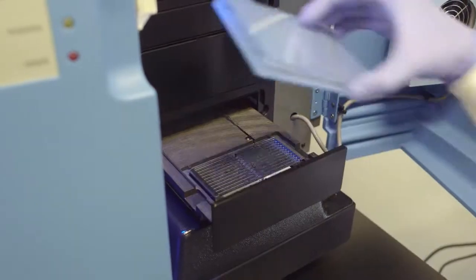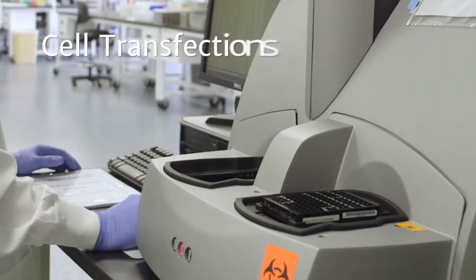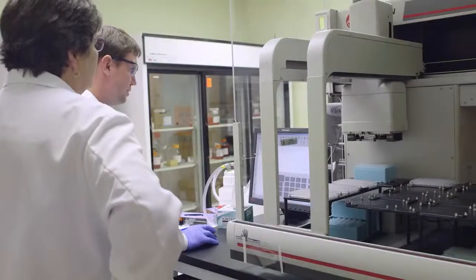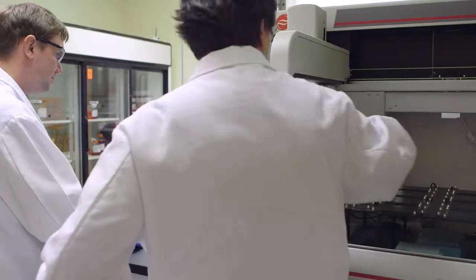In early phase discovery, a variety of systems and platforms can be used to select and validate targets and optimize the molecules designed to act on these targets. Novel therapies often have limited commercial reagent availability, and much time is spent generating model systems and custom reagents. Cell transfections, Western blot analysis, and proliferation assays are typical procedures for early phase drug discovery. Medium to high throughput automated screens are useful for prosecuting a large number of molecules efficiently and accurately as projects gain momentum.